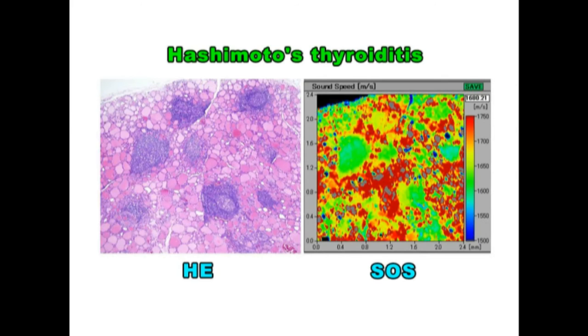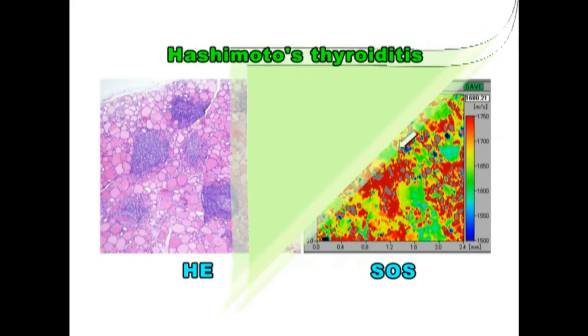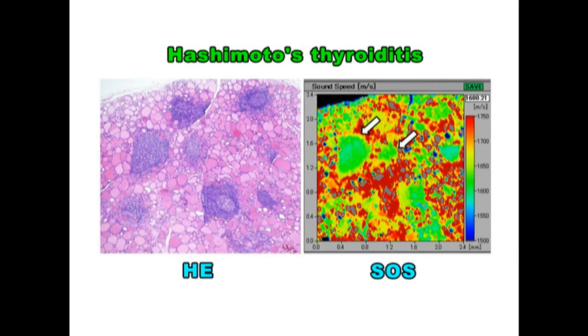This is Hashimoto's thyroiditis image. Several lymph follicles are present among thyroid follicles. Lymph follicles corresponded to green areas or approximately 1600 speed of sound. Dense colloids are red colored with more than 1700 meters per second.